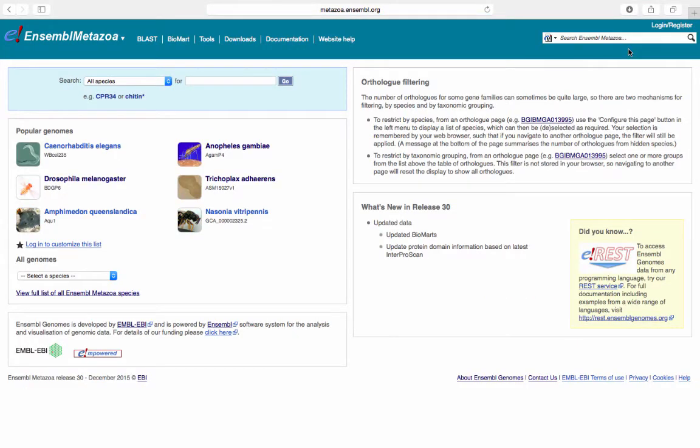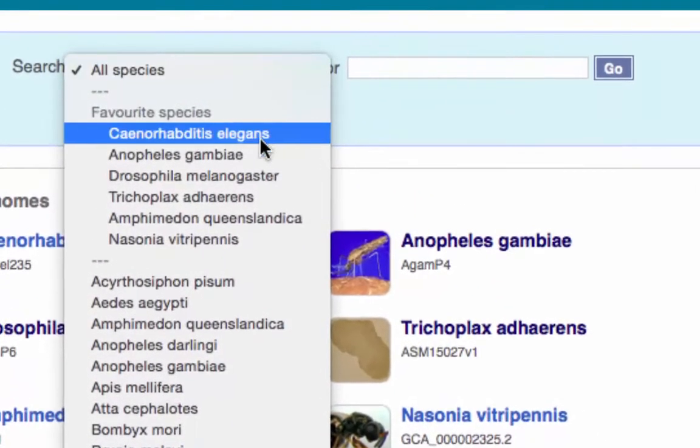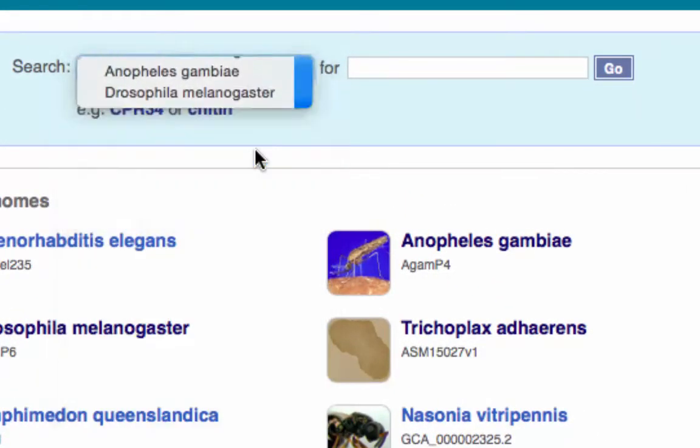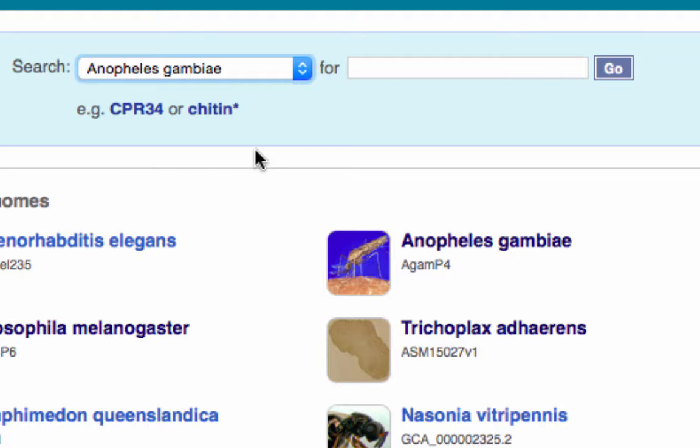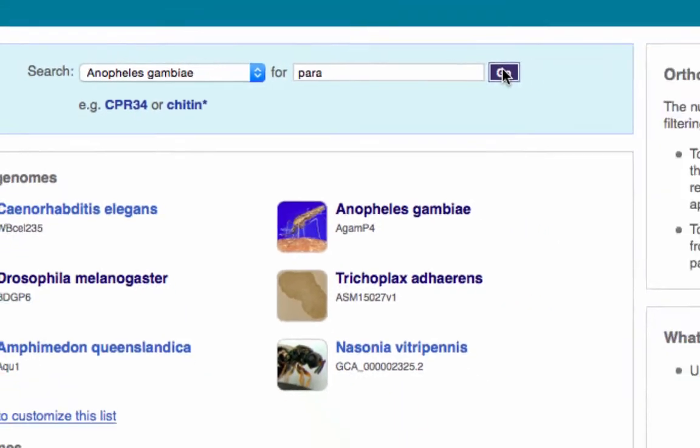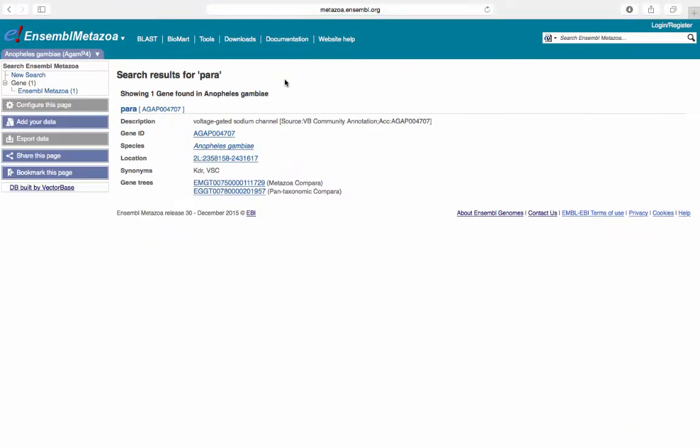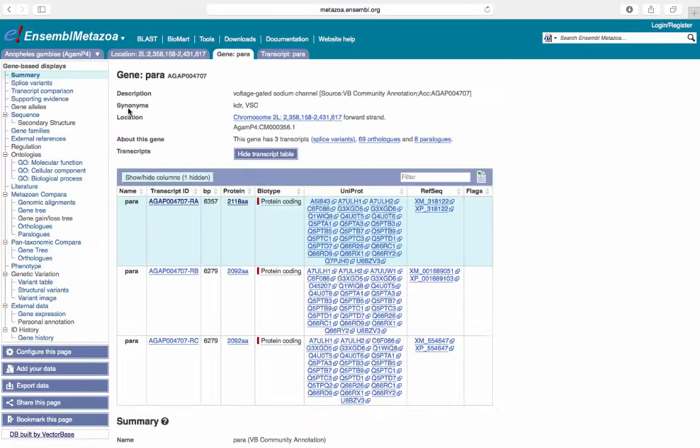Search the Anopheles gambiae genome for the Para gene by selecting Anopheles gambiae from the drop-down species menu. Type in Para and click Go. Click the link for the Para gene.